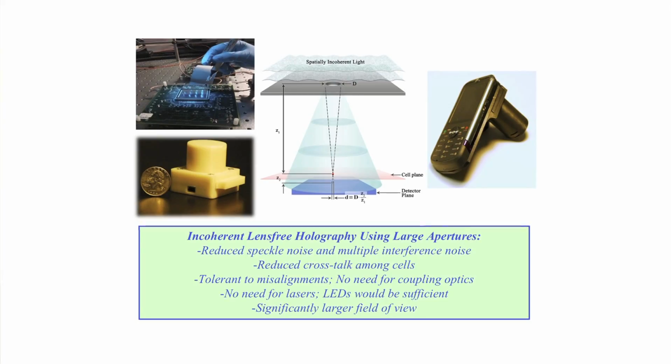They work very nicely. So there's some very nice physics behind this, which enable us to actually, even with incoherent or partially coherent light, reconstruct images of cells with a very large field of view. So I'd like to encourage you to go back, if you're interested in the physics of this, to some of our publications. We've recently actually used even the sunlight itself to reconstruct these shadows.